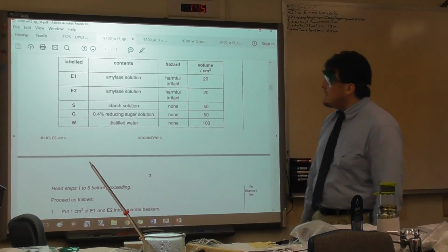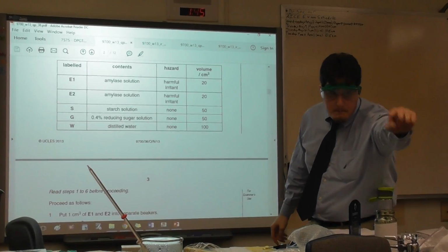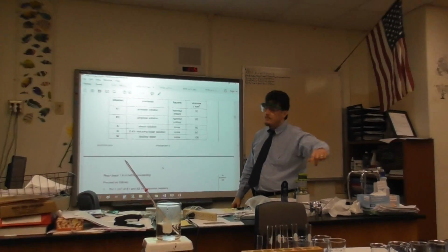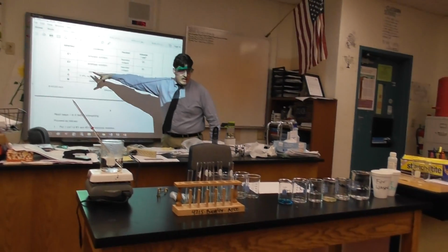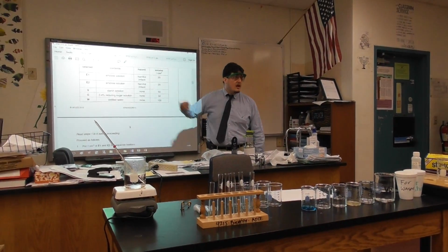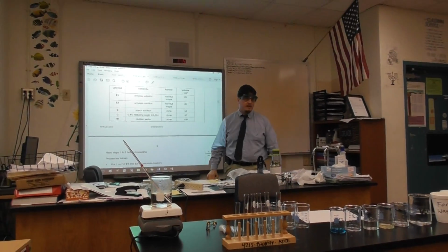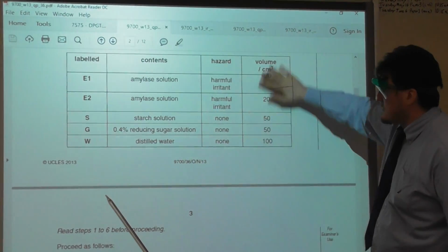Now, I am given E1, E2, S, G, and W. I have B, which is Benedict's solution. I have that. I am given E1, E2, S, G, and W. I have all of those there. Now, the quantity I am given doesn't really matter because I'm going to use a lot less. I don't really care about how much I am given. I care about how much I'm going to use. So this number doesn't matter.